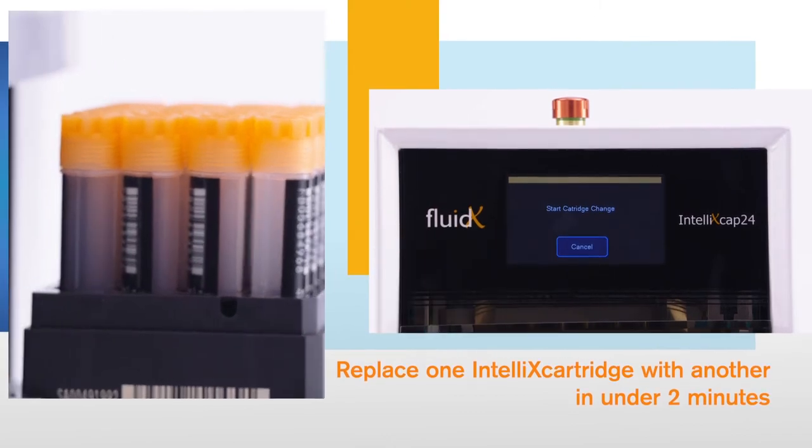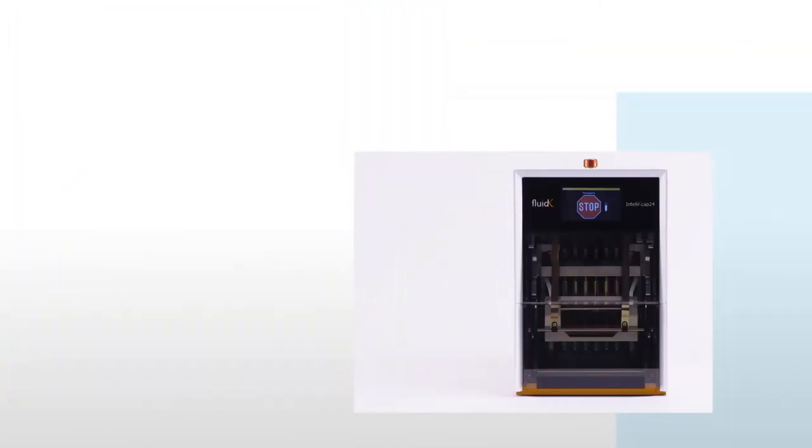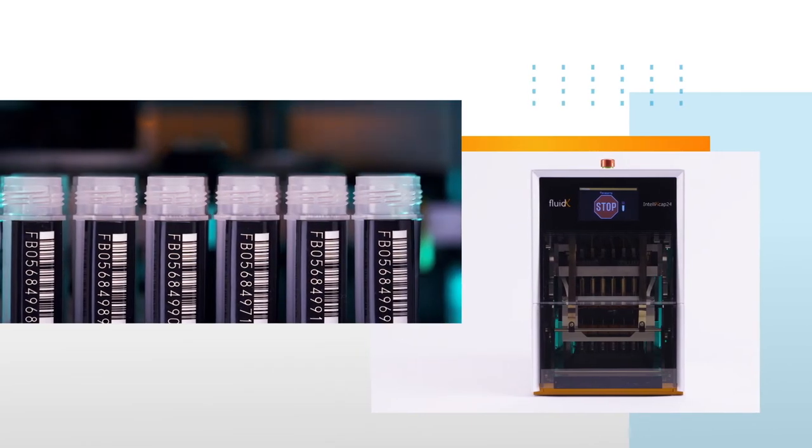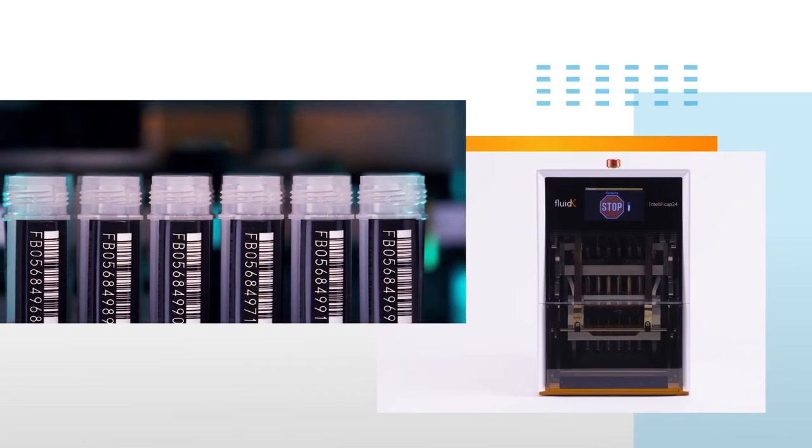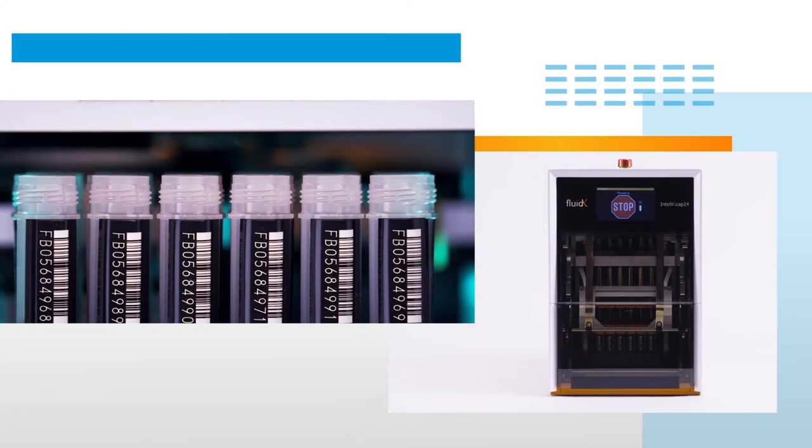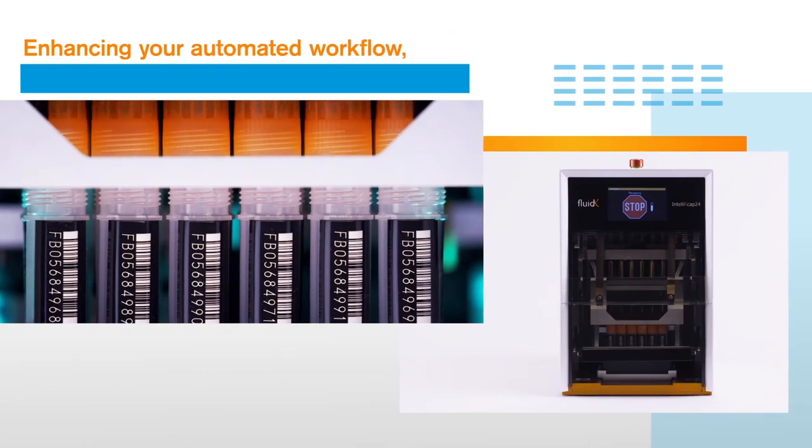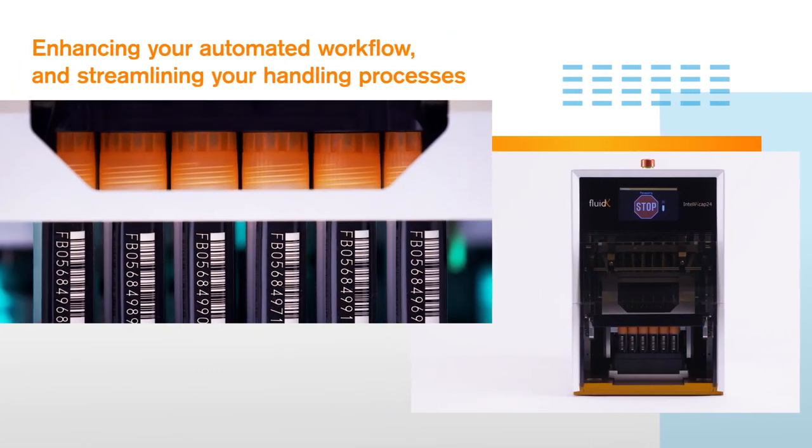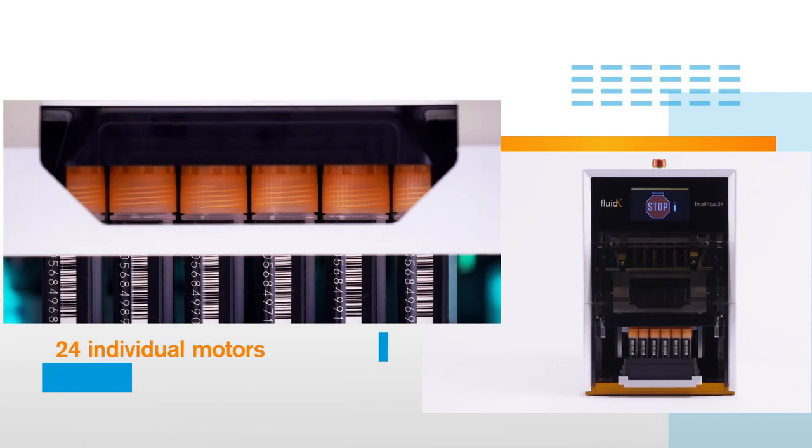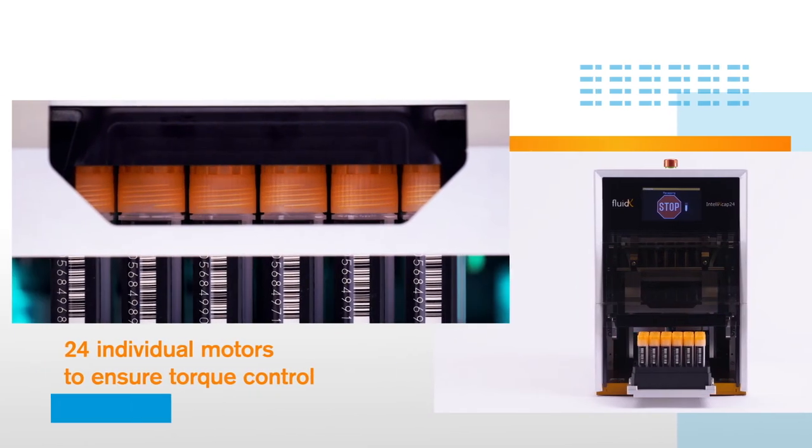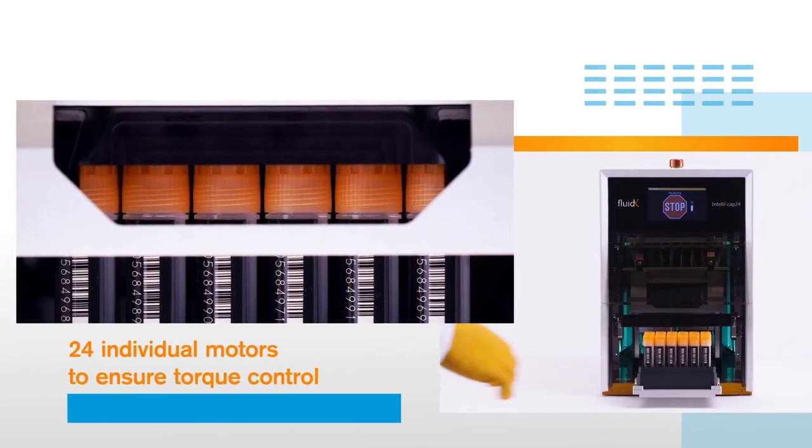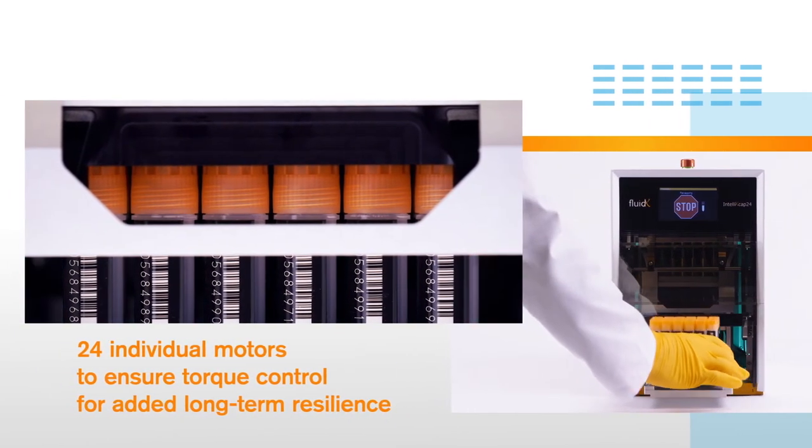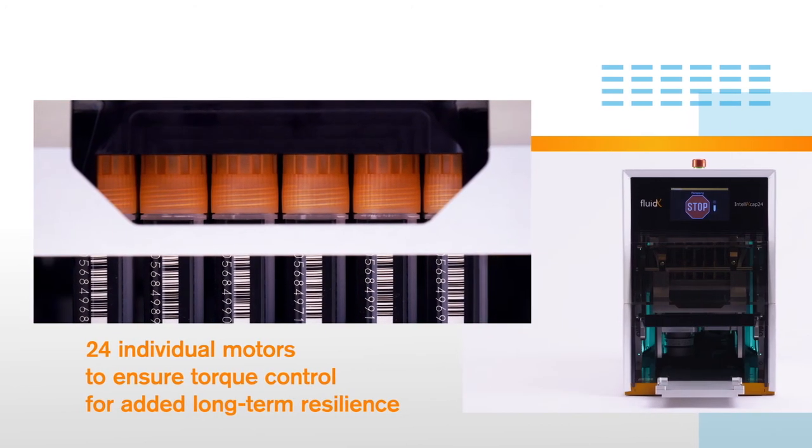No service call needed. From installation to integration, the Intelli XCAP24 is designed to fit seamlessly into your workspace, enhancing your automated workflow and streamlining your handling processes. It features 24 individual motors to ensure torque control for added long-term resilience in high-throughput labs and secure sealing.